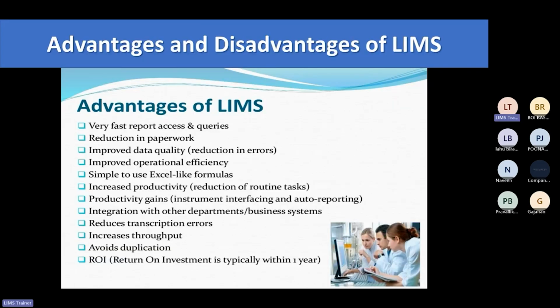Now some advantages. Okay, this is very basic. If you are already working with the laboratory, you understand this, right? So why is it important for the laboratory? It provides very fast report access and queries, right? Whenever you put some query there, it will generate the result instantly. Then paperwork will be reduced. Data quality will be improved. So you all understand this, right? That also will be involved in the course.